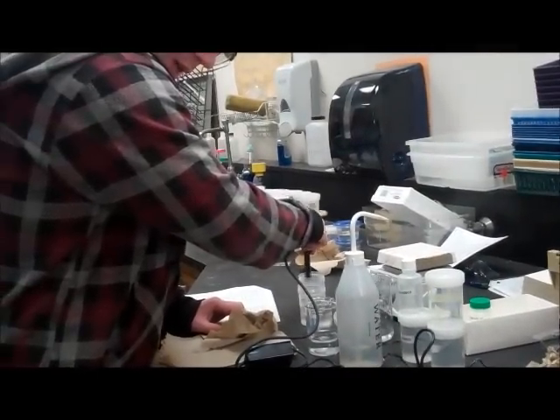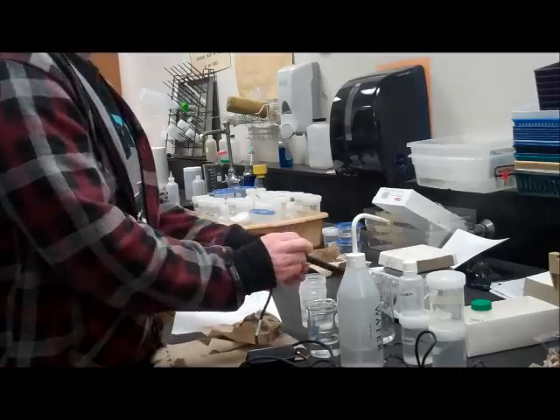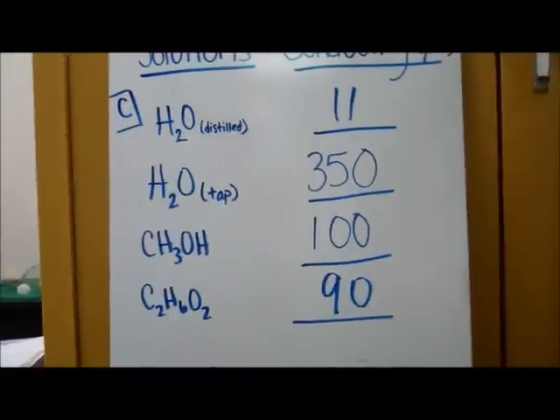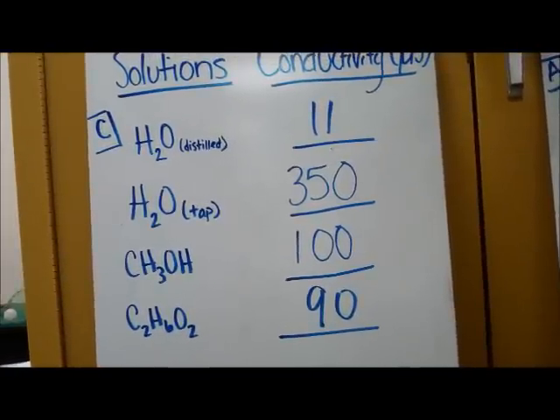And 90. So these are the group C solutions.